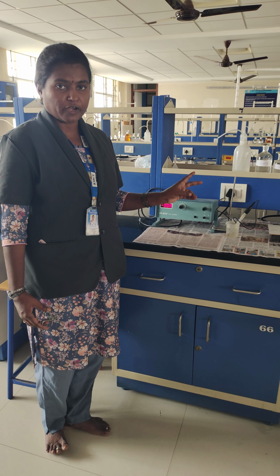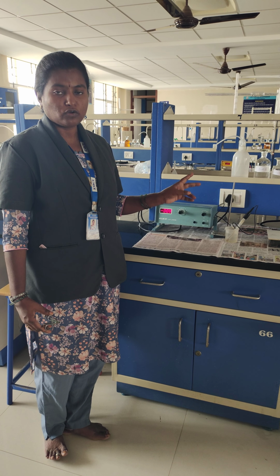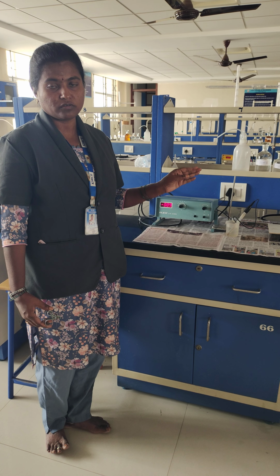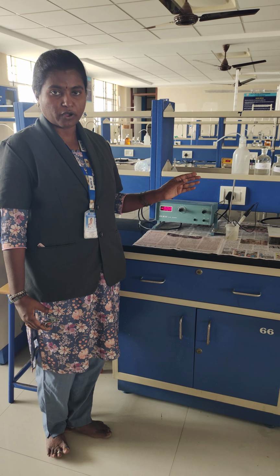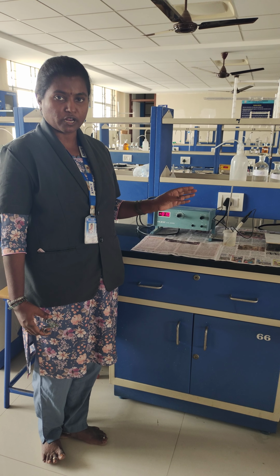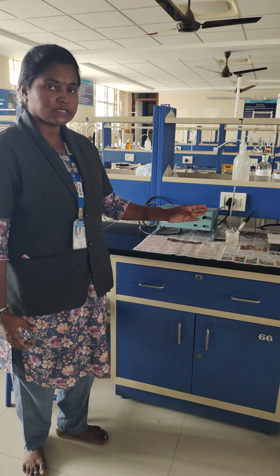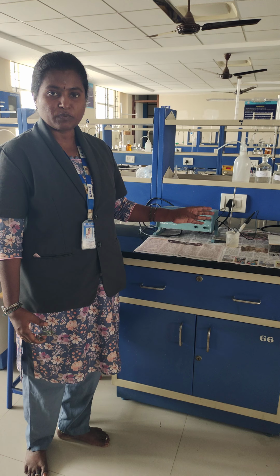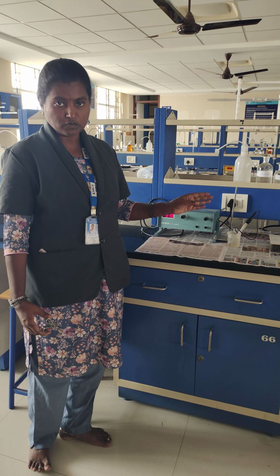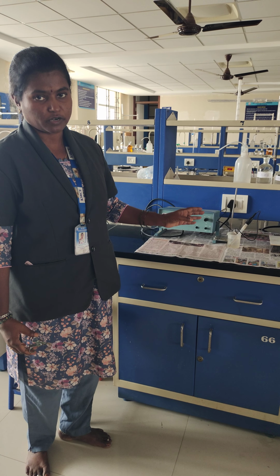Now we have to find the value of the normality of sodium hydroxide, that is N2. N2 is equal to V1 N1 divided by V2. By this formula we can find the normality of sodium hydroxide, then multiply it with the equivalent weight of sodium hydroxide, 40, and you can get the amount of sodium hydroxide present in the given sample solution. This is the experimental procedure for finding the concentration of the given solution, whether it is acid or base, by using this pH potentiometric method. Thank you.